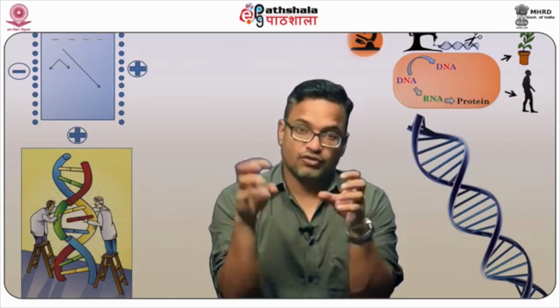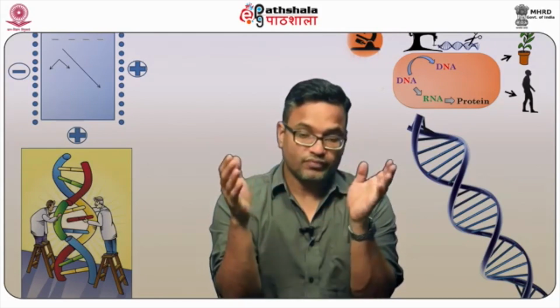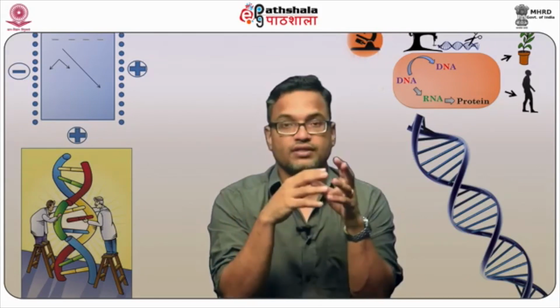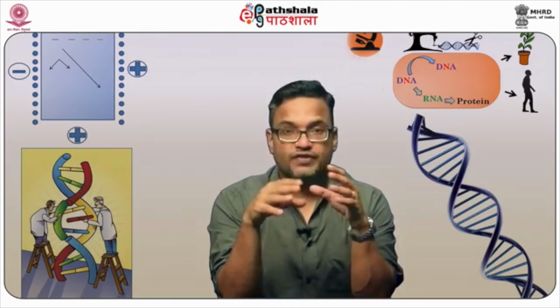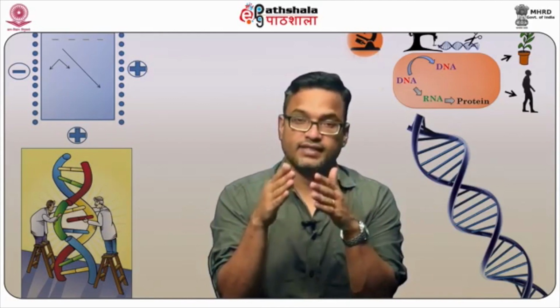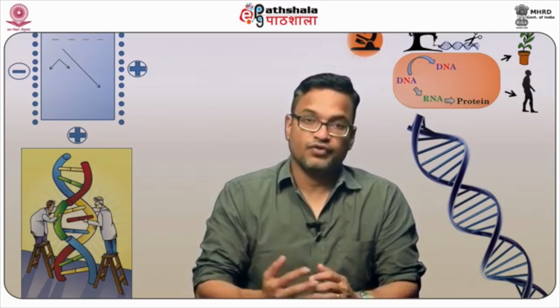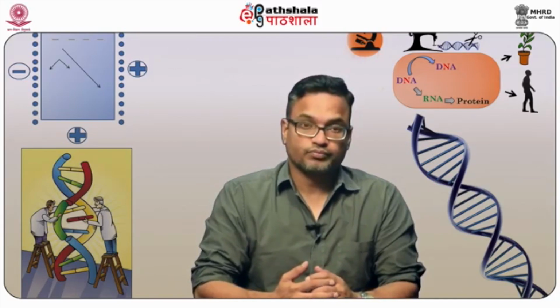Those secondary or scattered electrons resulting from the surface are captured and used to generate the image. The difference between these 2 techniques, TEM and SEM, is the way they generate 2-dimensional or 3-dimensional data, and this will be discussed in future slides and future modules.